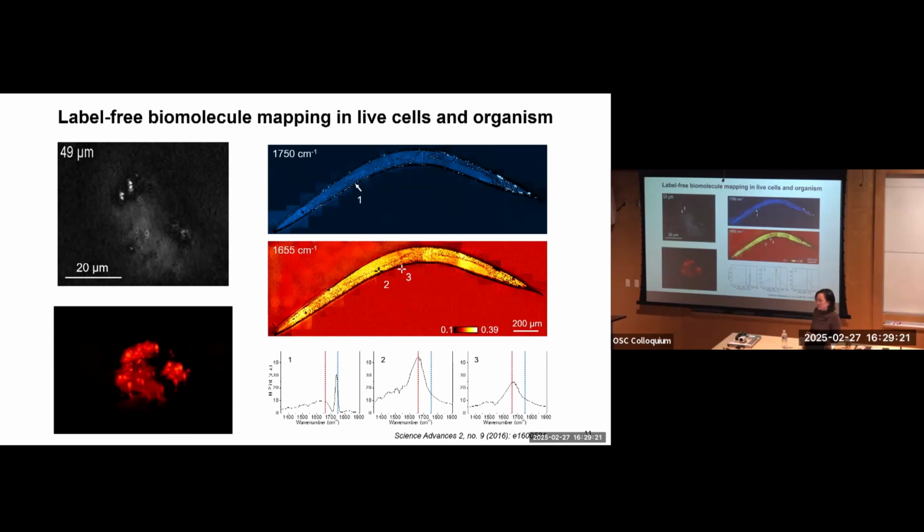So that's the only thing you consider, the change of refractive index due to the change of volume? I think that's a major contribution, but there are also different mechanisms for different samples. Say you have a thin film sample, the index change is straightforward to understand because the interface reflection is changing.